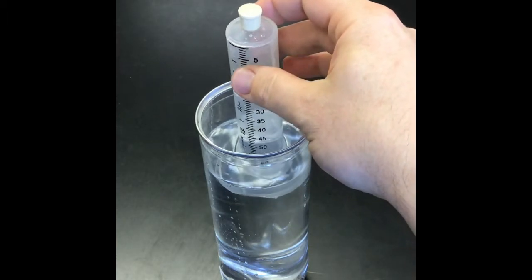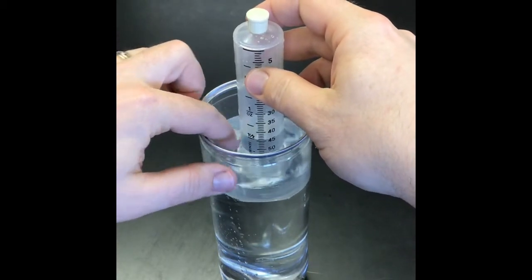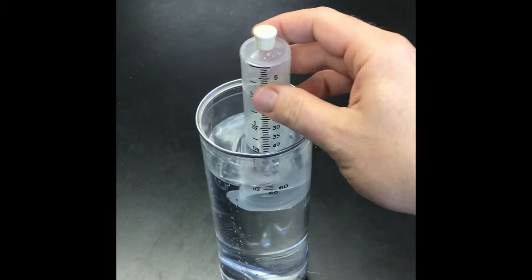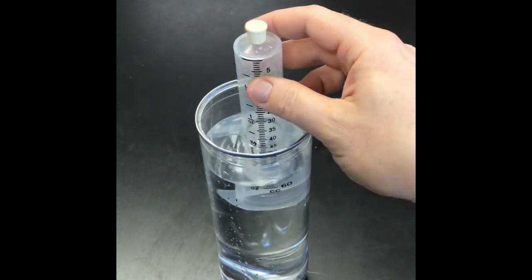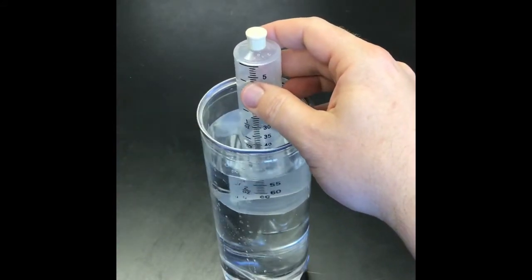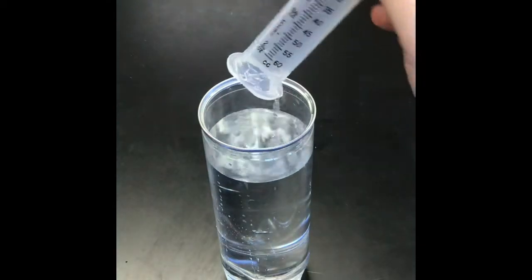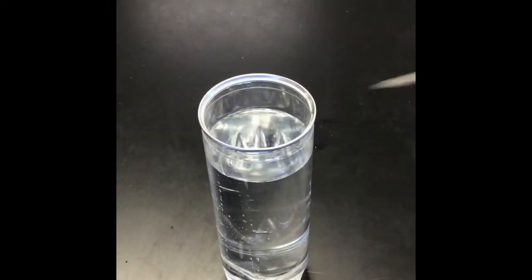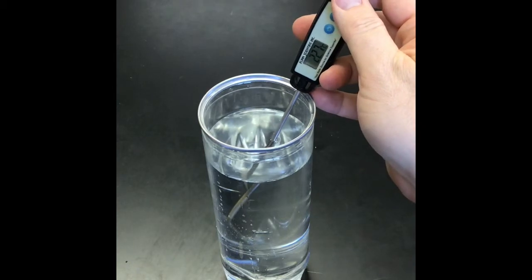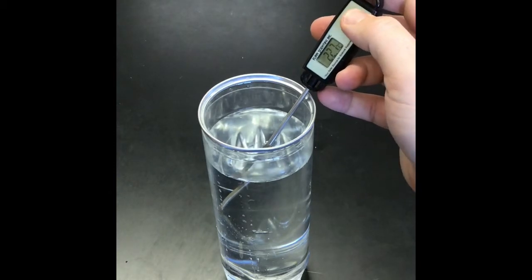Now, when you read the volume of this, it's important that the liquid volume inside the syringe is equal with the liquid volume in the tennis canister. So you have to get down on the level and make sure that those two line up, and when the liquid level inside and outside are at the same height, that's the volume that you read off of the syringe barrel. Once you've read the volume, you can take the syringe barrel, simply pick it up and open it, and let the gas out. You want to read the temperature of the water that you bubbled the butane through. This is what we'll use to help determine the vapor pressure of the water that evaporated into the syringe, as well as the butane gas bubbling into it.